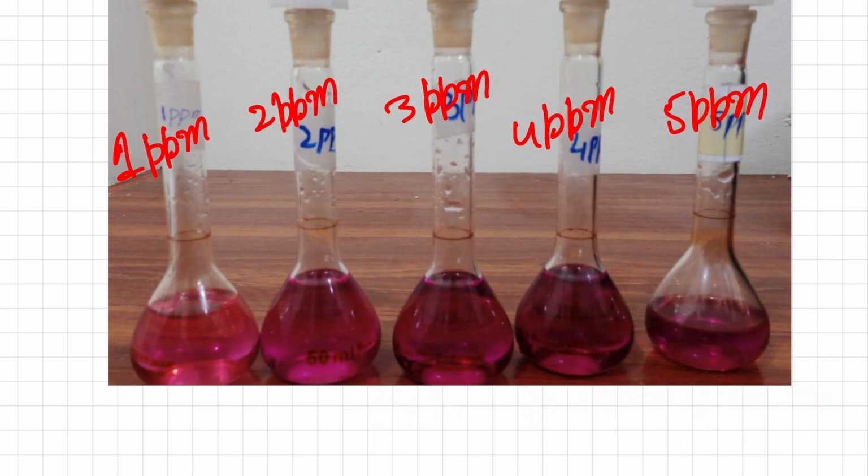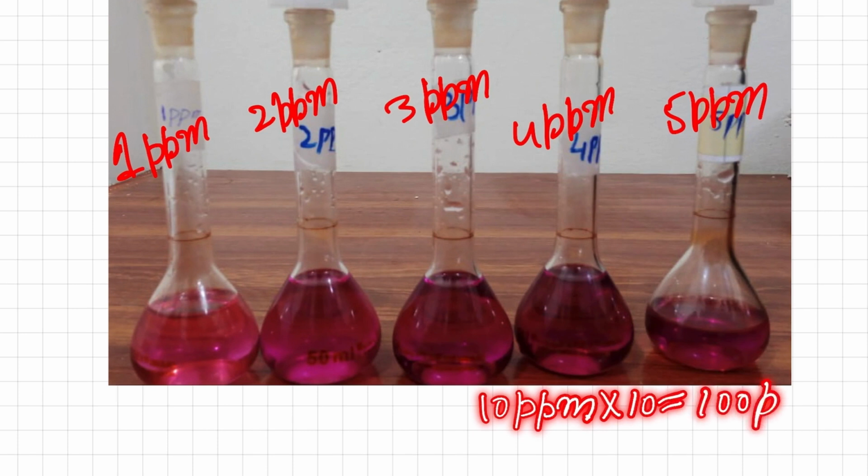You will then get your unknown concentration. For example, it reads 10 ppm, but as originally you have diluted the solution 10 times or 100 times, in order to give the final answer, you will multiply this with your dilution factor, and then you will give the final result after multiplying with how many times you have diluted your original solution.